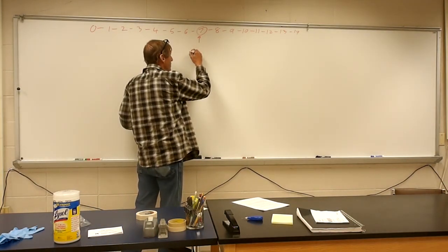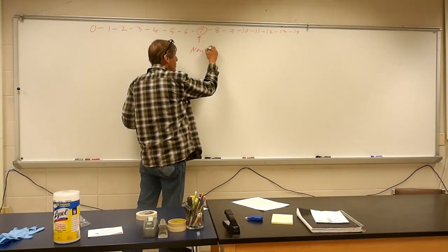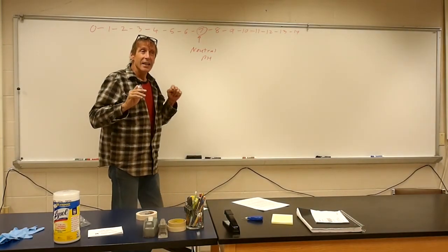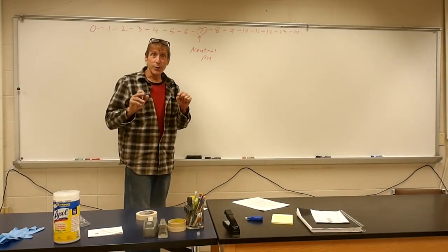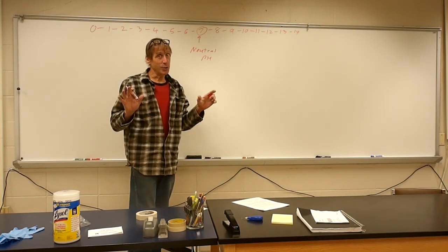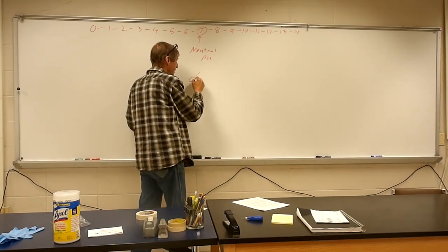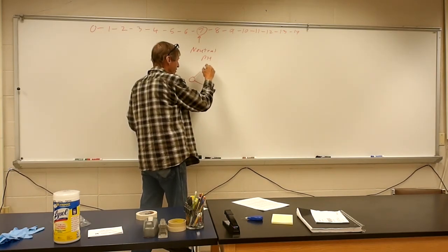7, the midpoint. This is referred to as a neutral pH. This is the pH of pure water. If you took distilled water, measured its pH, if it's good distilled water, it should have a pH of 7. Actually, why do you have hydrogen ions in pure water anyway that's been distilled?